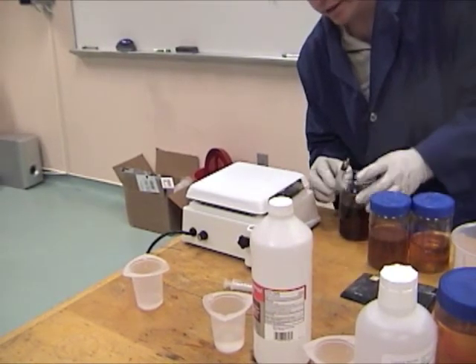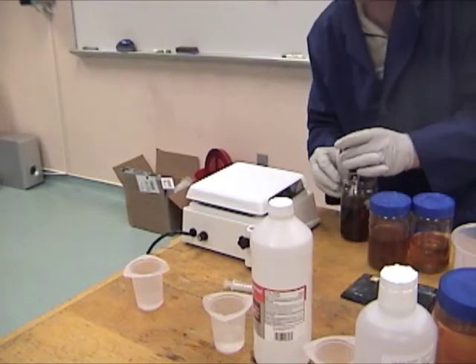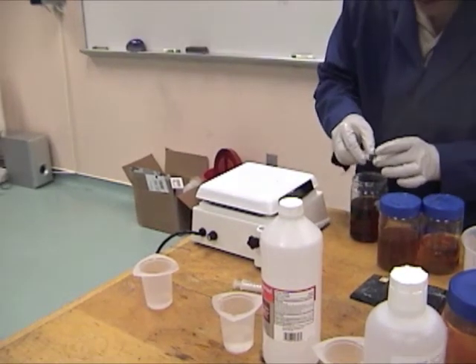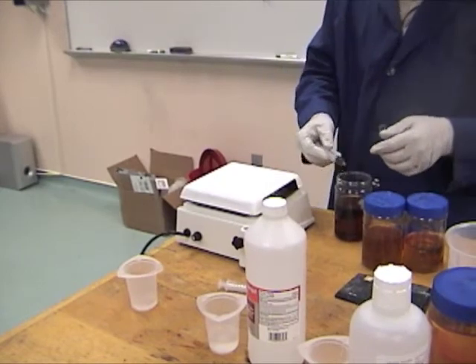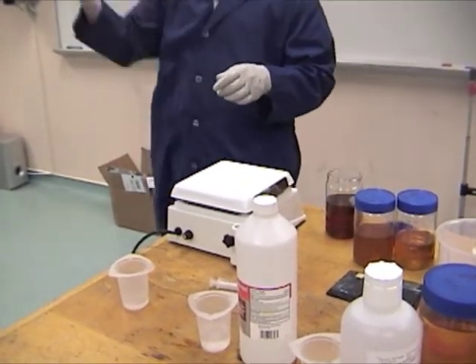Get that bubble out of there. Also, I don't care who you are, this is messy. I've never met anyone that can do this without paper towels and stuff. So I have 1 milliliter of my mystery oil, and it's going to go into here.